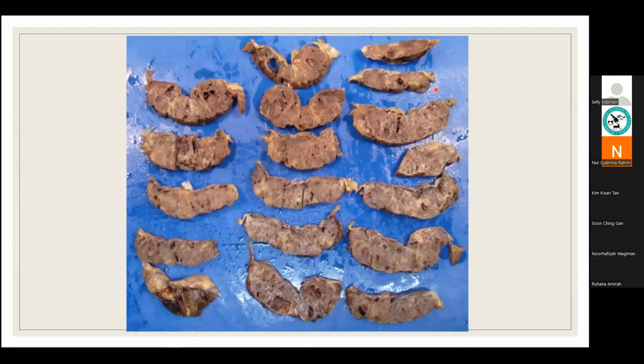Okay, so I just want to show you the area that has the fibrin deposition here. Again here, seen here, here as well. So basically it's just a firm tan-white lesion.